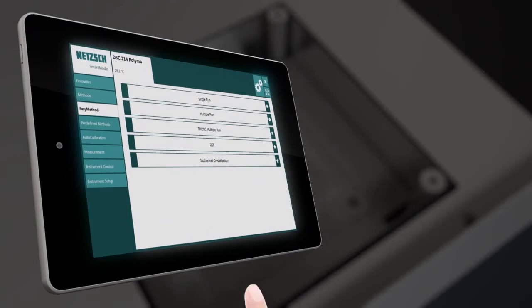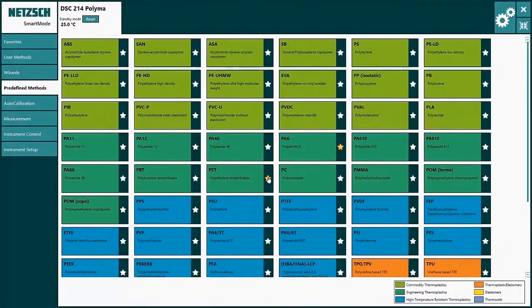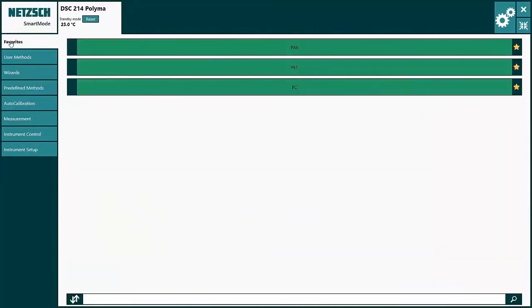As a beginner, you can use the touch-optimized smart mode and its predefined methods, which assists you in your daily measurement tasks.